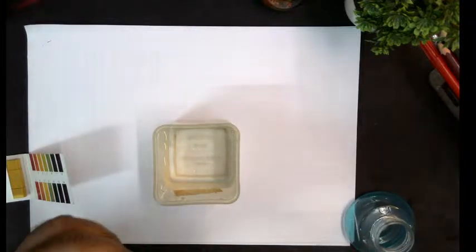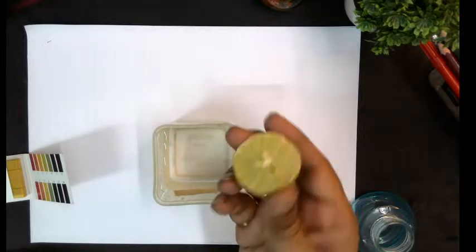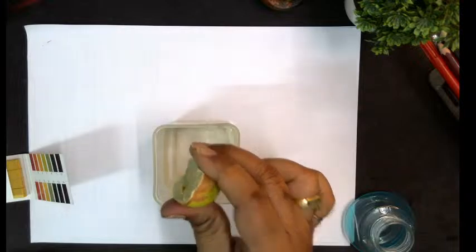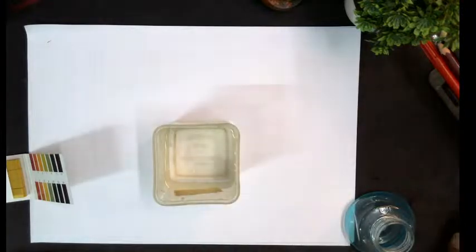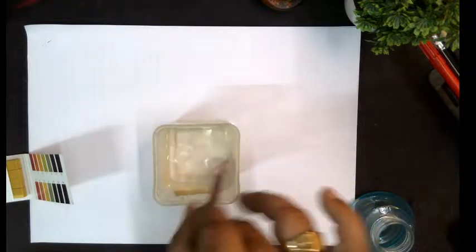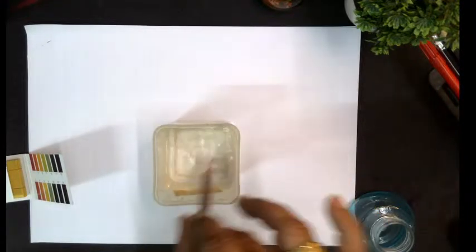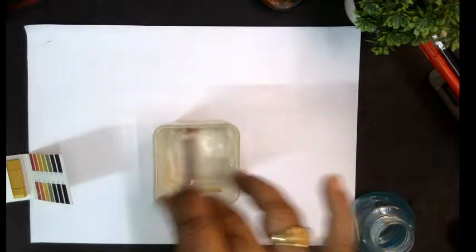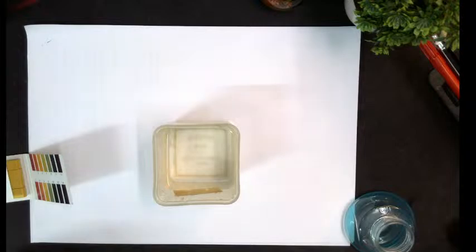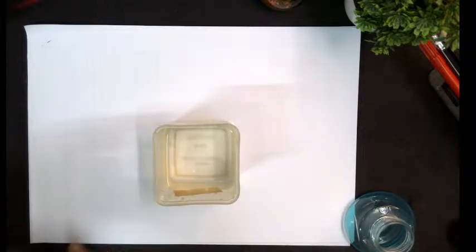Let me add a few drops of lemon here and check the pH. So we have to mix it thoroughly, and since the lemon has citric acid, it will show the pH in the range of acid.